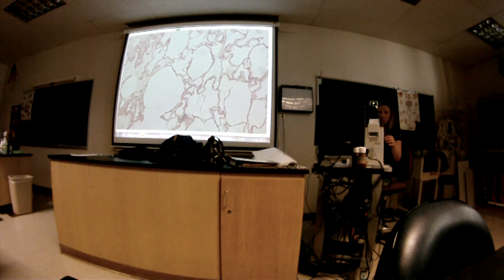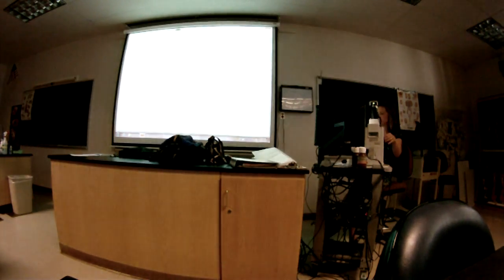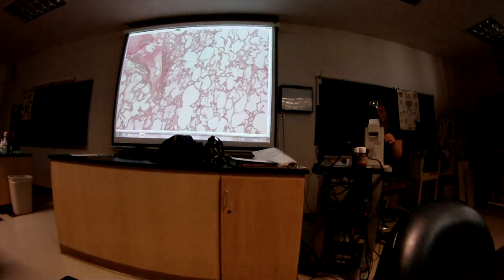Let's do one more slide, and then we'll go back over the answers, and then move on to some more slides. Assuming we have time. We will. Okay. Keep these in order.